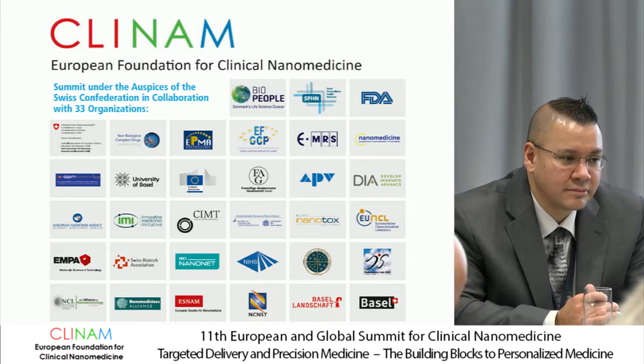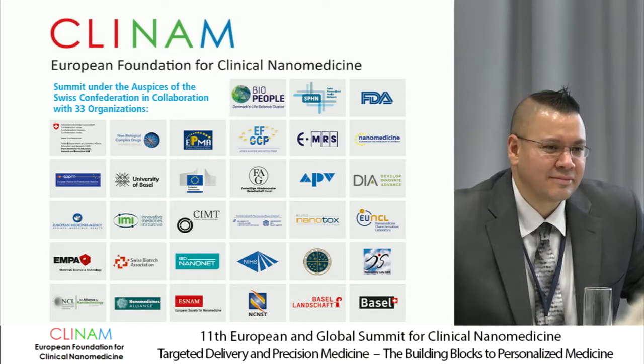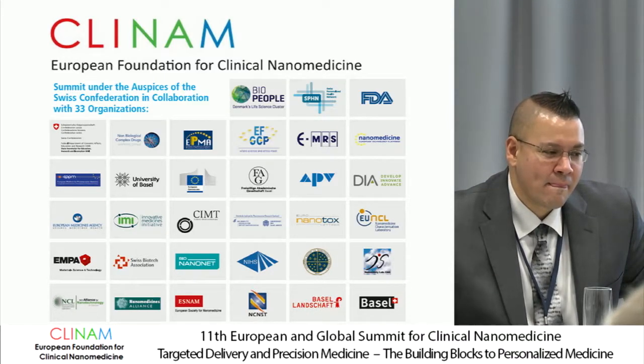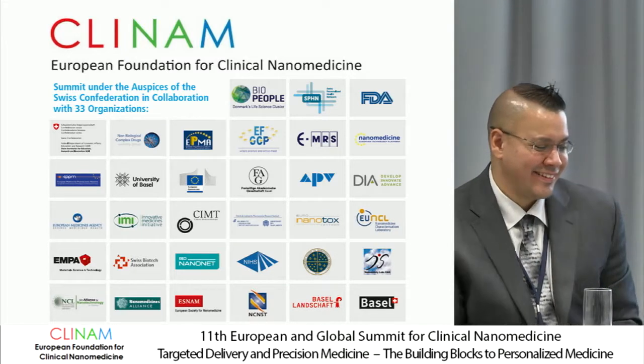So is really reporting the average and eventually a low resolution parameter which more or less indicates the polydispersity enough for a critical quality attribute, or should we somehow start, I don't know how, this is complex, to compare particle size distribution in a more statistical way, or at least always report the D50, I don't know. So this is something else that I would like to ask to all of you.